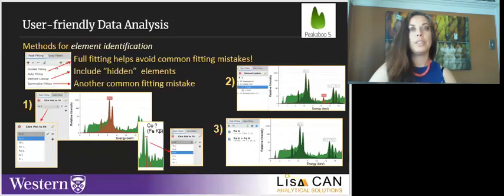In example 2, the user is using the element lookup to add in arsenic. This is very useful if you want to look for trace elements that may be highly localized, like the PGE inclusions in the coin, gold in a drill core sample. Finally, example 3 shows the fitting of the iron plus iron summation. It's important that these processes be recognized and not interpreted as a single element.